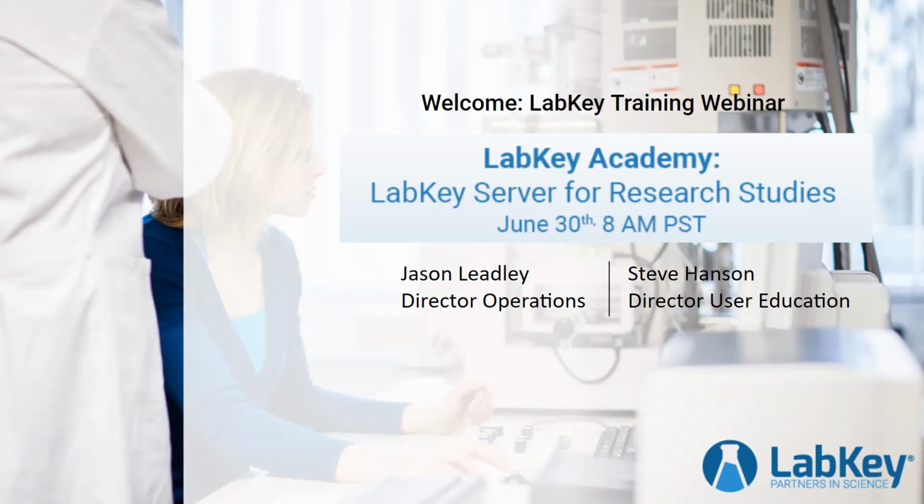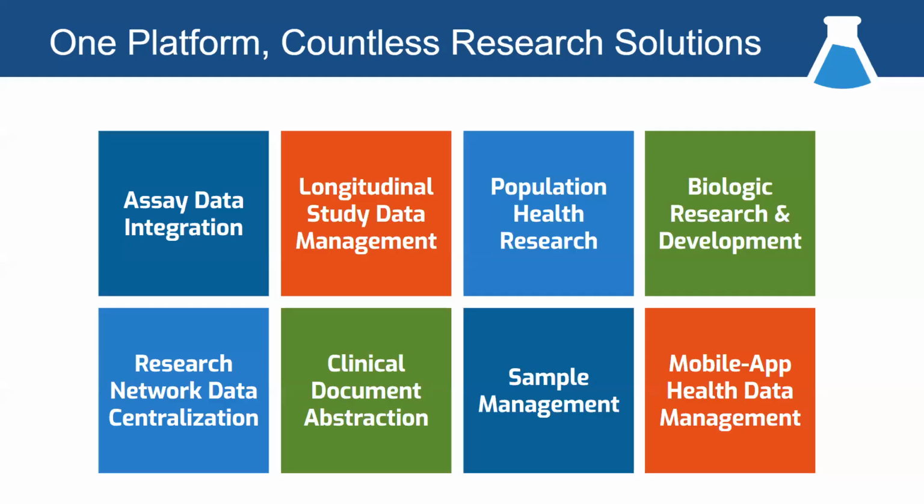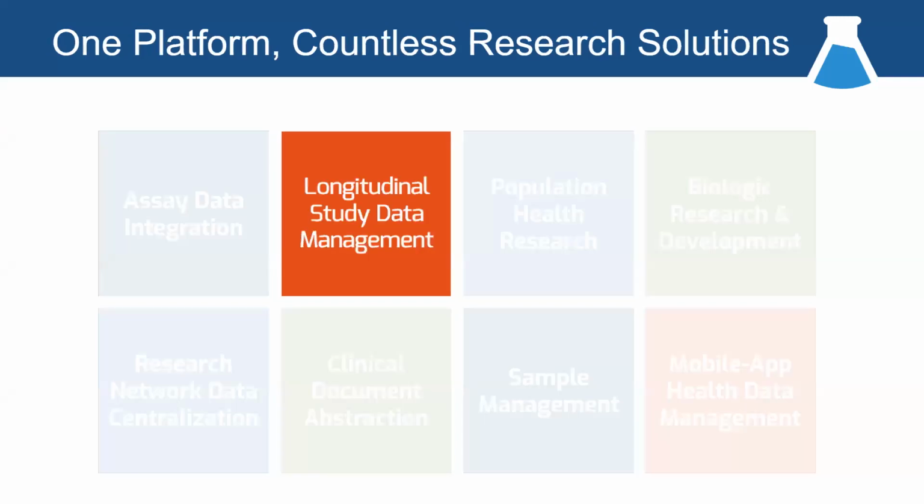So as most of you will know, LabKey Server is a highly flexible and configurable toolkit. We often refer to it as a toolkit, and it's configured specifically to solve a very wide range of different research data challenges across the research environment. There are literally countless different ways the platform can be used. All of these are real world examples.